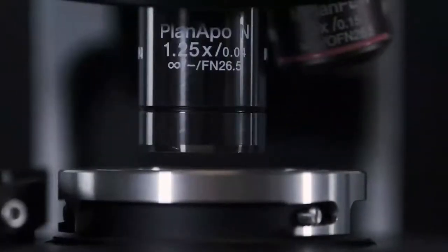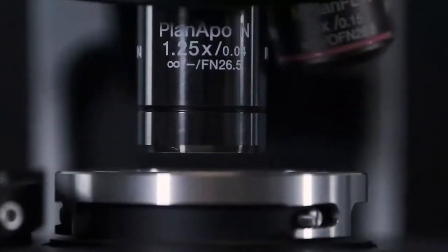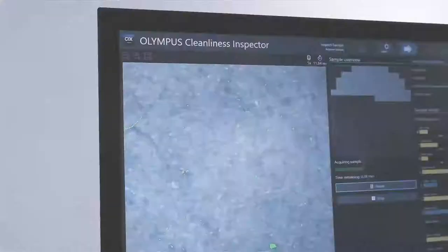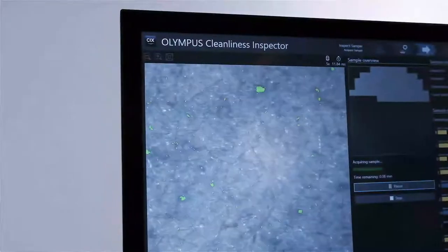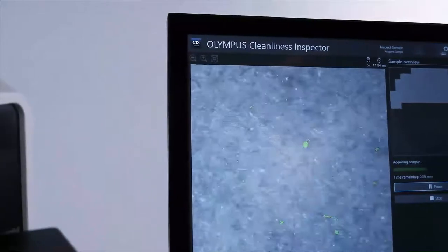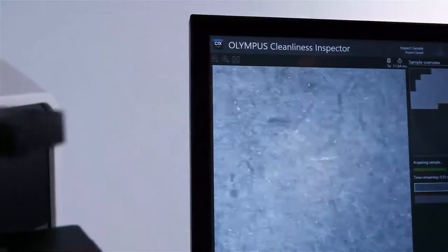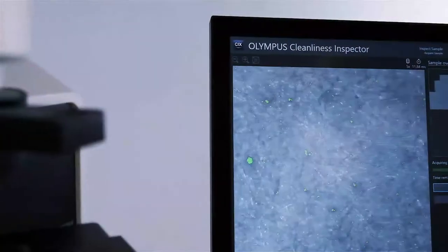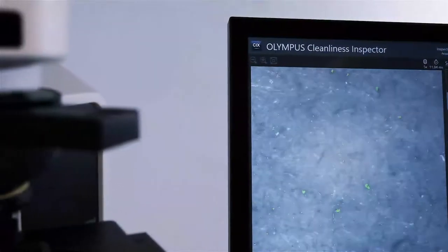The seamlessly integrated hardware and software combined with the intuitive step-by-step user guidance reduce cycle time, cost per test, and handling errors.